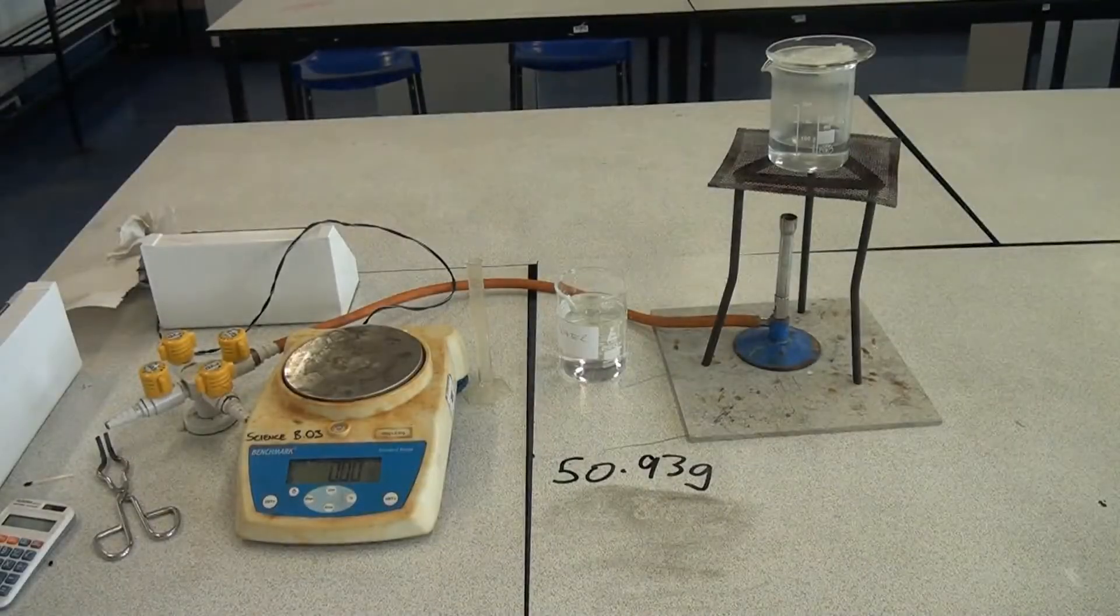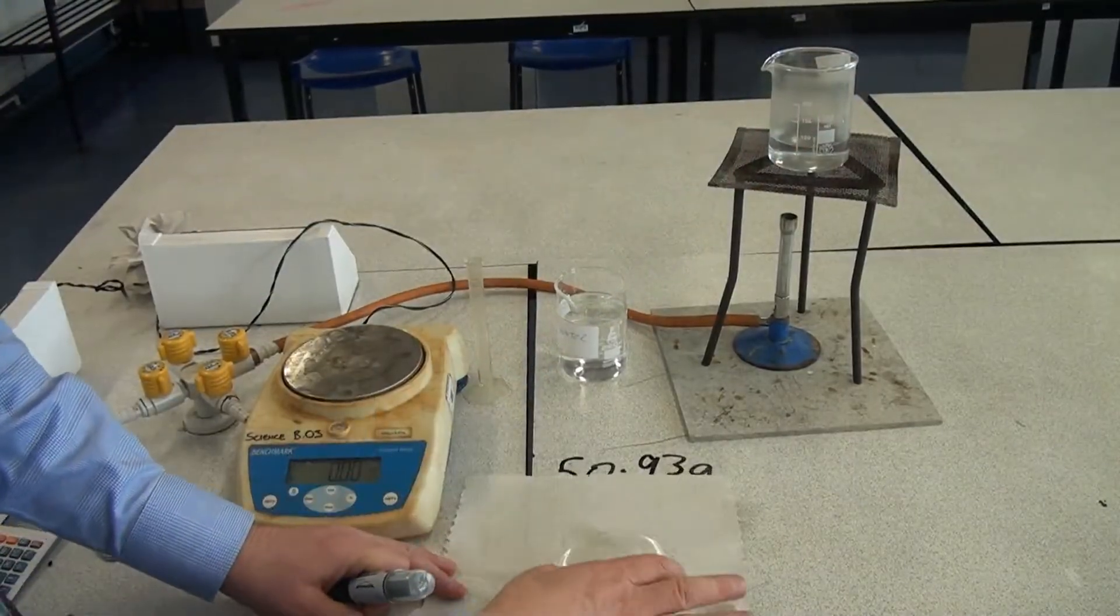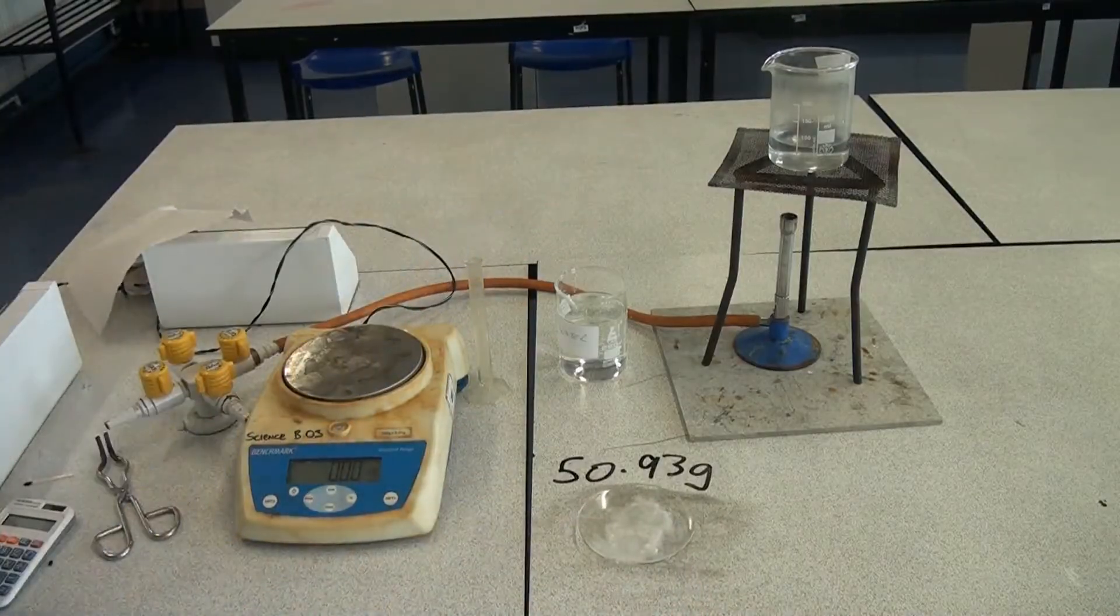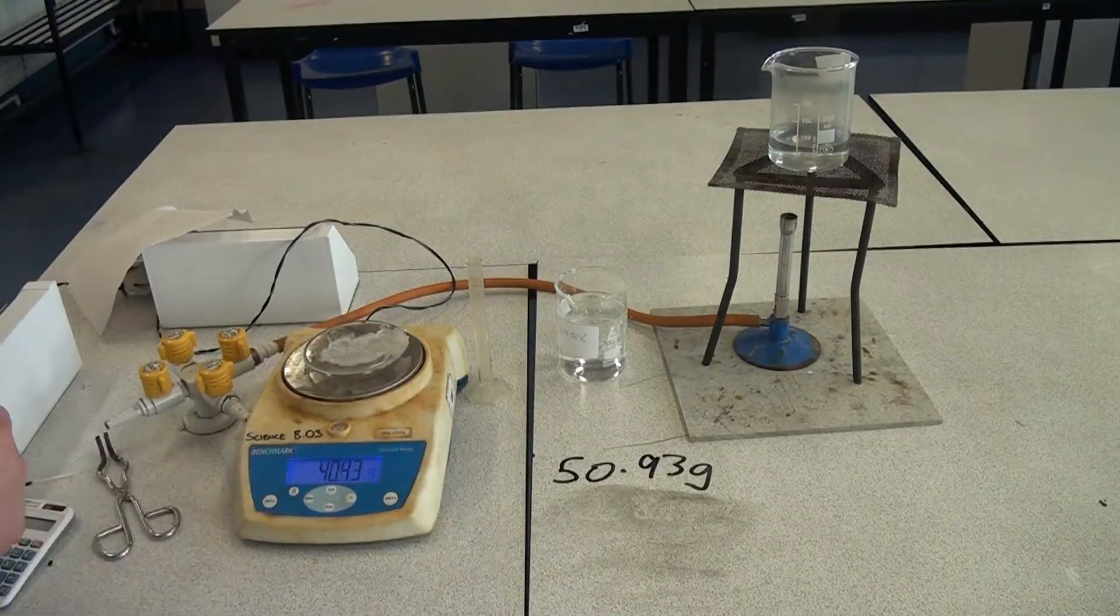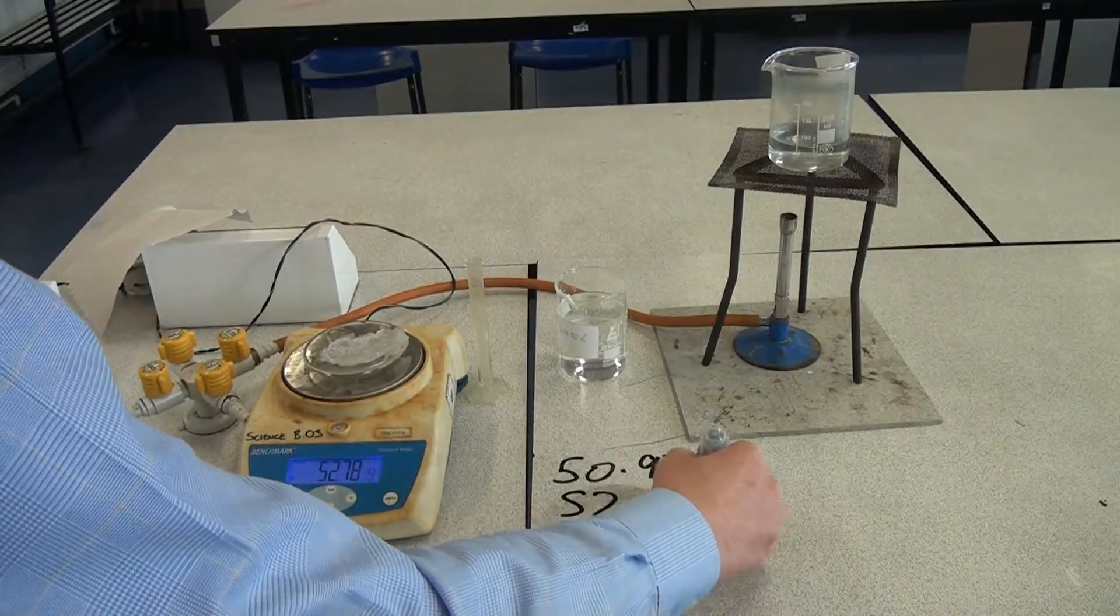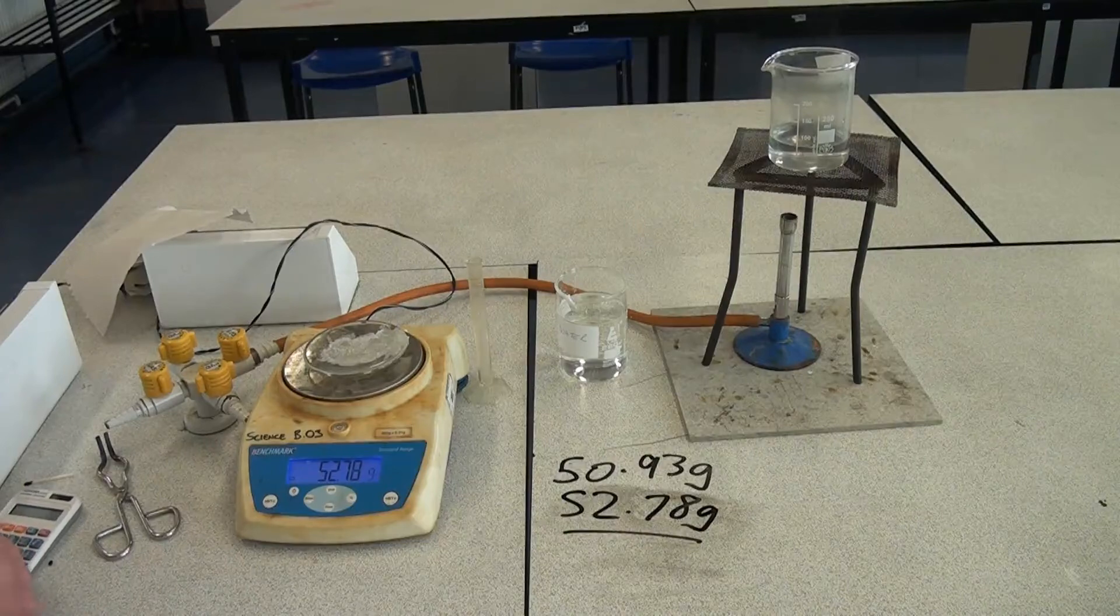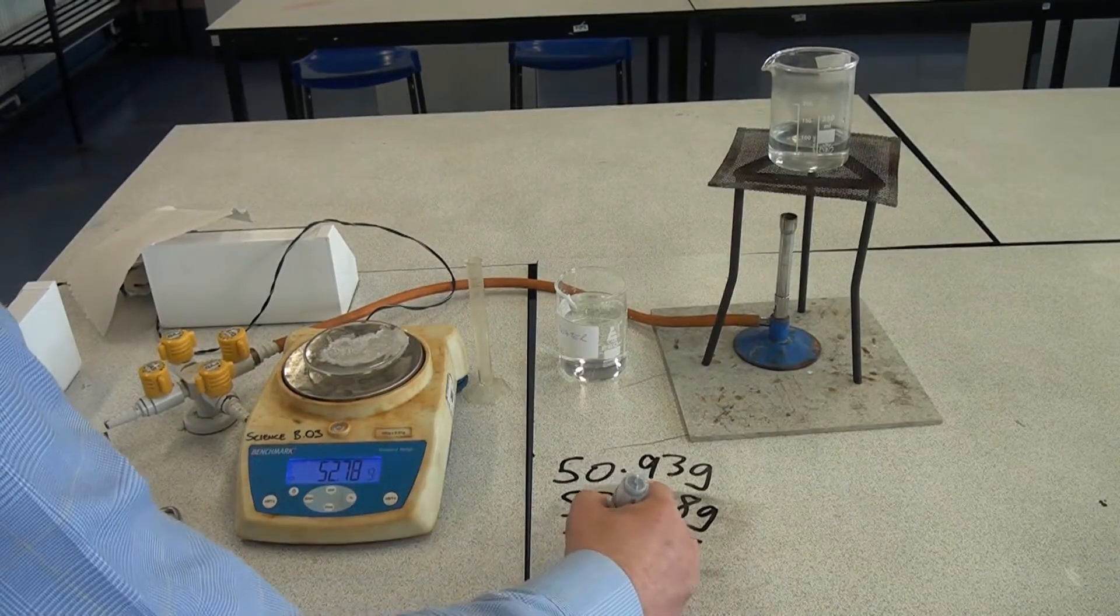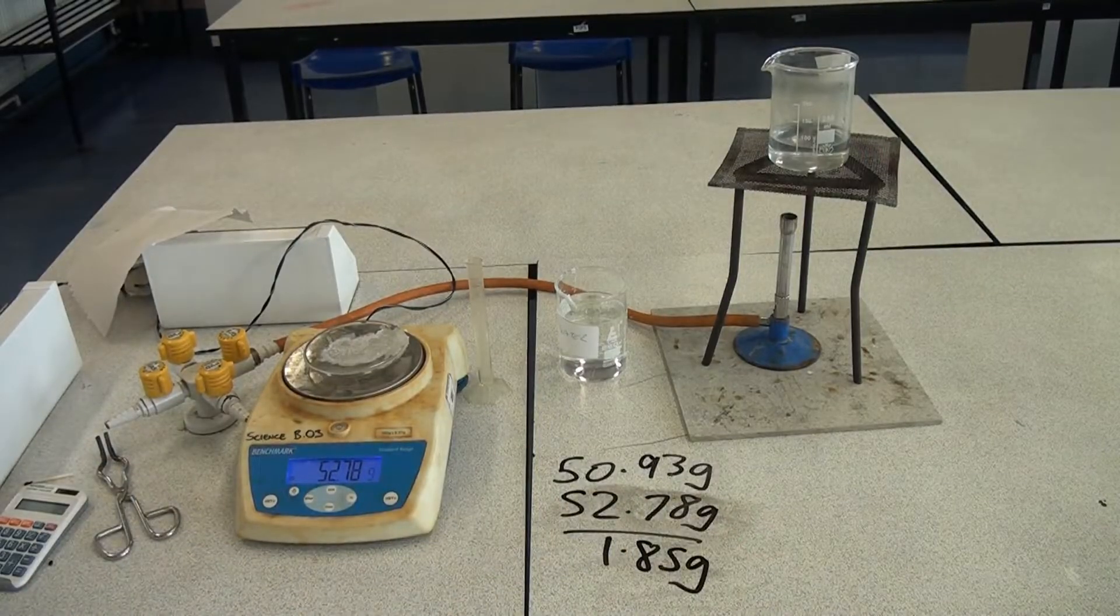Now that the watch glass has cooled, I'm going to take it off the water bath and it's important that we dry underneath the watch glass with a paper towel, just in case there's any condensation underneath there from the steam from the water bath. And if I re-weigh the watch glass, the mass should have gone up, which it has to 52.78 grams. So to find the mass of salt, I do 52.78 grams take away 50.93 grams, and that gives me 1.85 grams of salt in that 4 centimeters cubed sample of seawater.